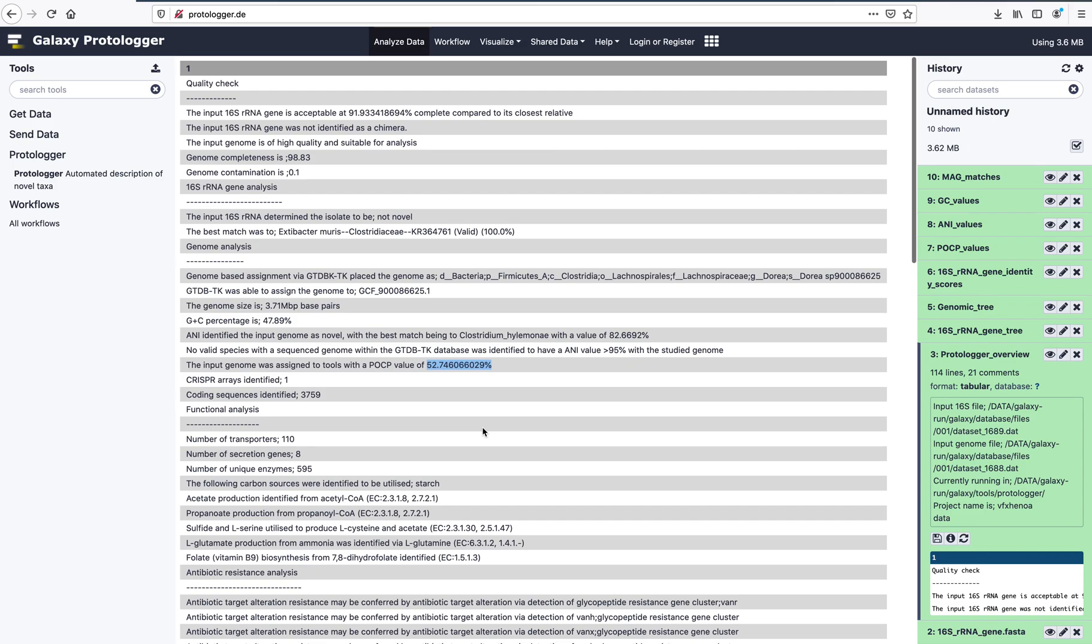For users aiming to describe a novel taxon, Protologa provides all the building blocks for taxonomic placement. However, the user must integrate these blocks together to decide a final placement and if the isolate is novel or not.